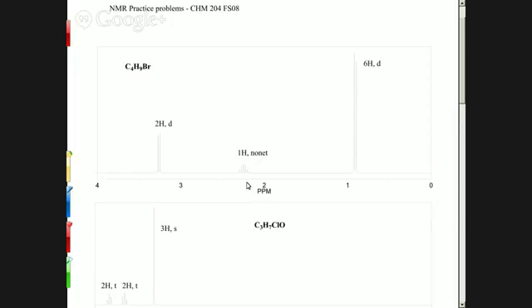The CH was next to this one. So here's a simpler thing. Yes, all of that is true, but here's a simpler thing. In order to have a group of 6, that means you need 2 CH3s that are in the same chemical environment. These two are not. This one is closer to the bromine, and this one is farther away from the bromine. So we would expect to get 2 separate CH3 peaks with this, rather than 1 6. So you have to put those in an arrangement where they are chemically equivalent. They are in the same place.